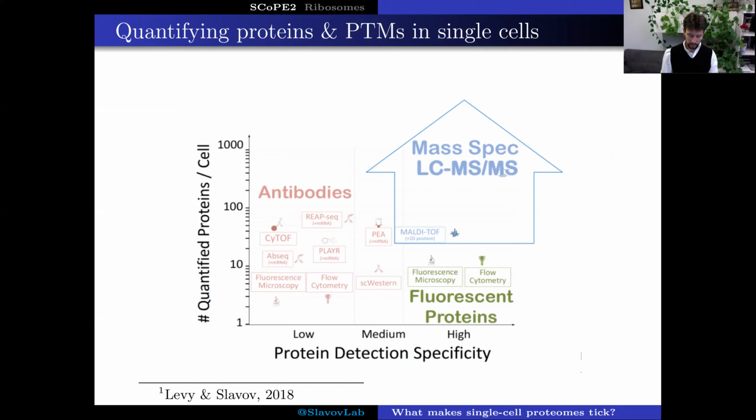And usually such protein measurements are performed using antibody approaches, but they afford only limited specificity, and they have allowed quantifying relatively few proteins per sample. So we were interested in developing mass spectrometry-based methods that can increase both the specificity and the throughput of quantification so that we might be able to specifically quantify many thousands of proteins across many thousands of single cells.